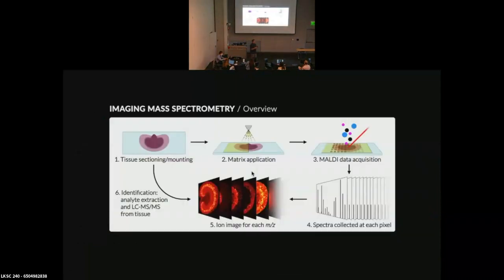Now, since I'm the first talk in this session, I do want to do a little bit of teaching. There are various kinds of imaging mass spectrometry. Our version is what's called matrix-assisted laser desorption ionization. I think this is the technology that everybody speaking today will be covering. This is a laser-based approach. This setup is very similar to a standard microscopy experiment.